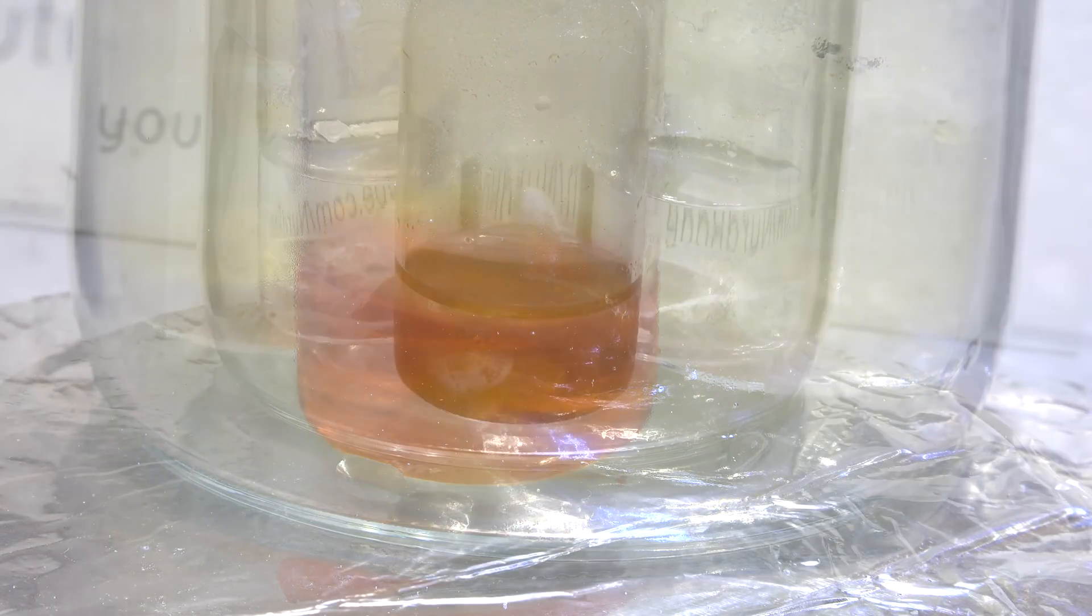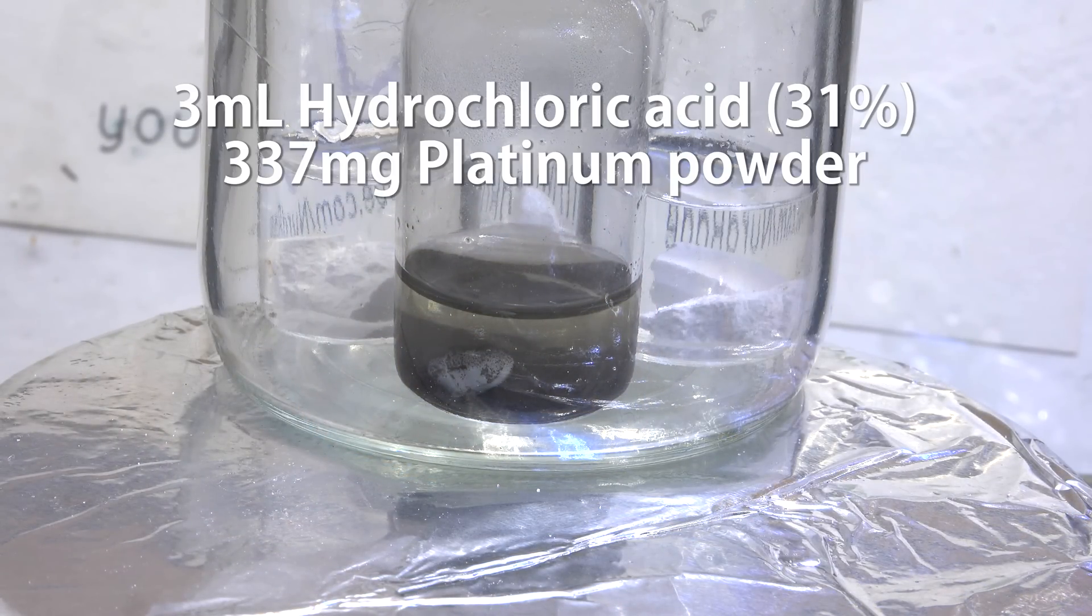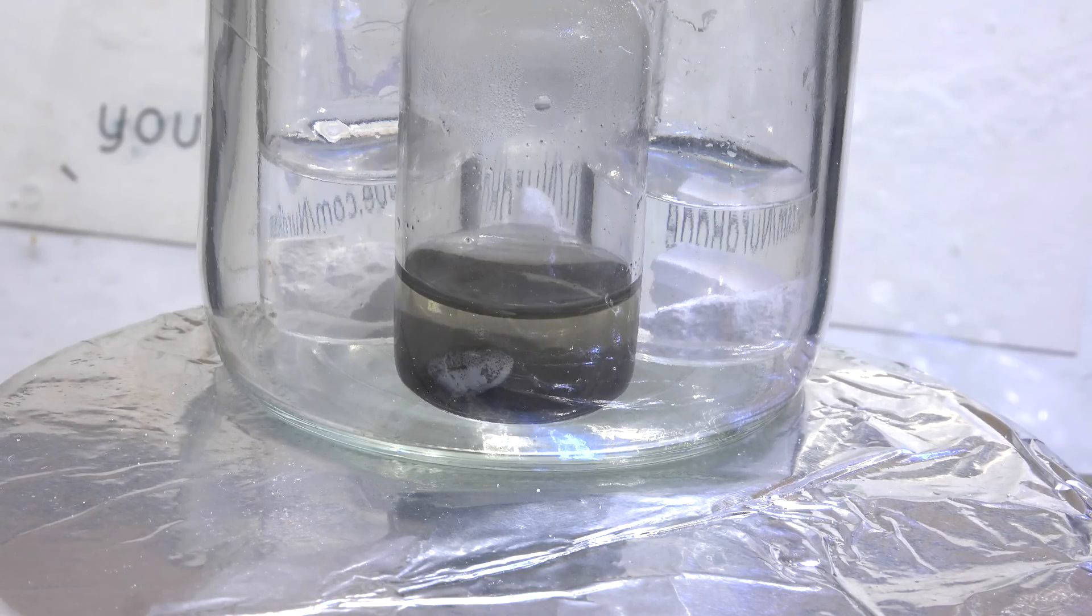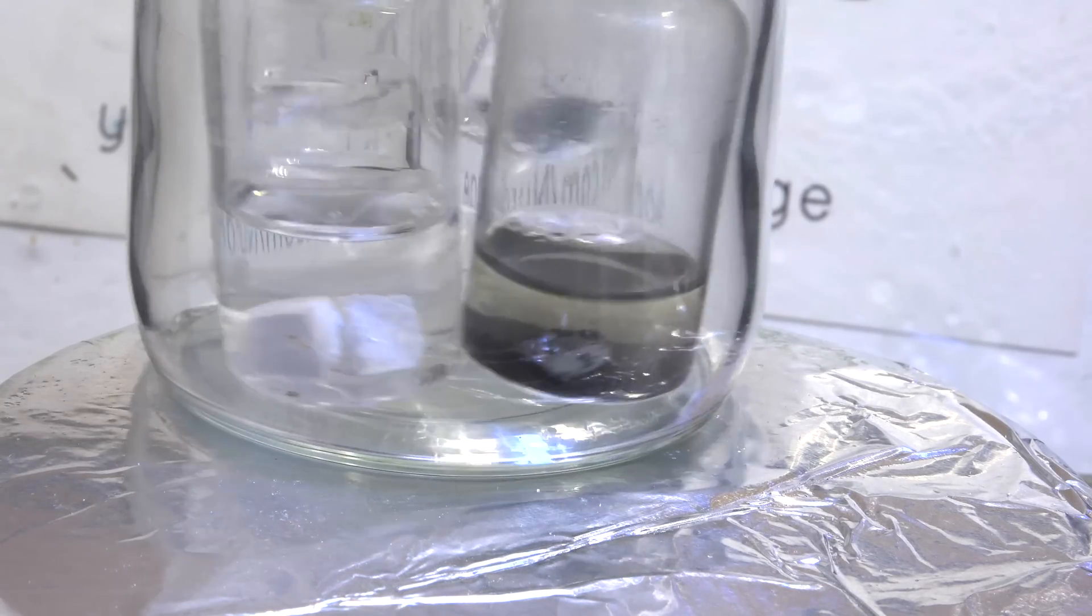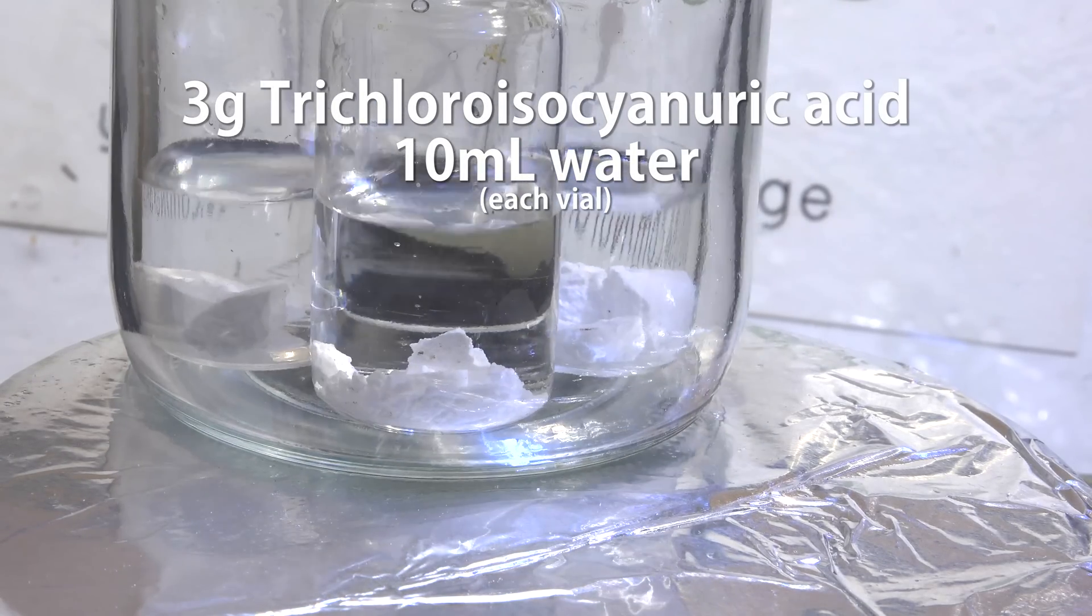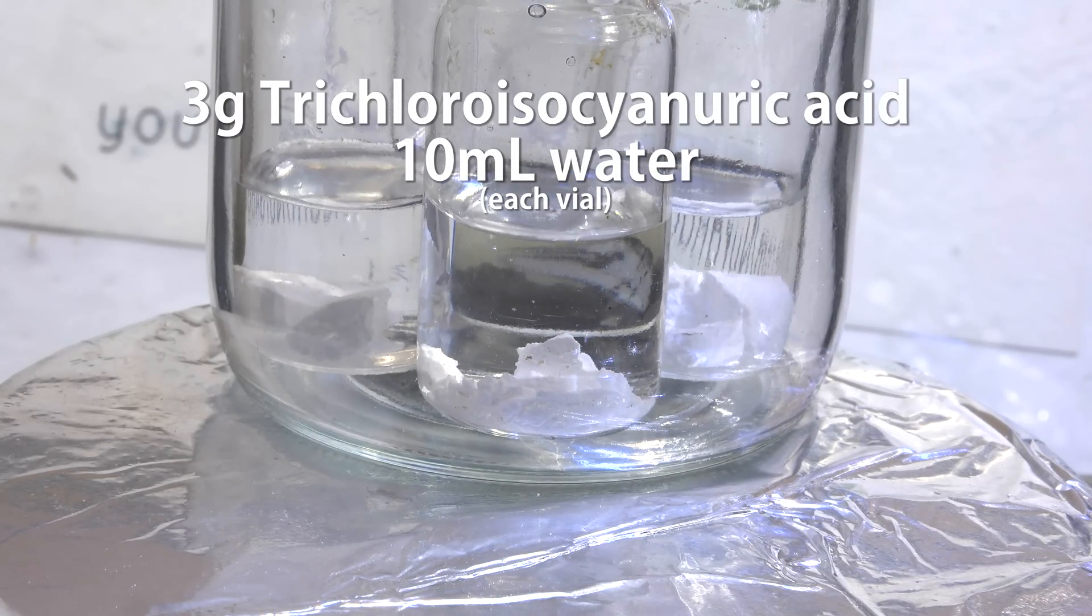To do this is actually pretty simple. Here I have a jar, and in front you can see a vial containing 3mL of hydrochloric acid and 337mg of platinum metal powder. This is actually the same platinum metal powder we made in a previous video on refining platinum. In the back of the jar there are 3 vials containing 3g each of trichloroisocyanuric acid in 10mL each of water.